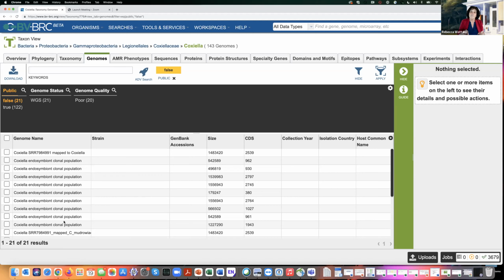But I can draw from each of these sources to compare my data to any of the data within the resource. And you can see how seamlessly it's integrated, and that it's all been treated the same way. We're not doing apples to oranges, we're doing apples to apples. Everything is annotated exactly the same way.